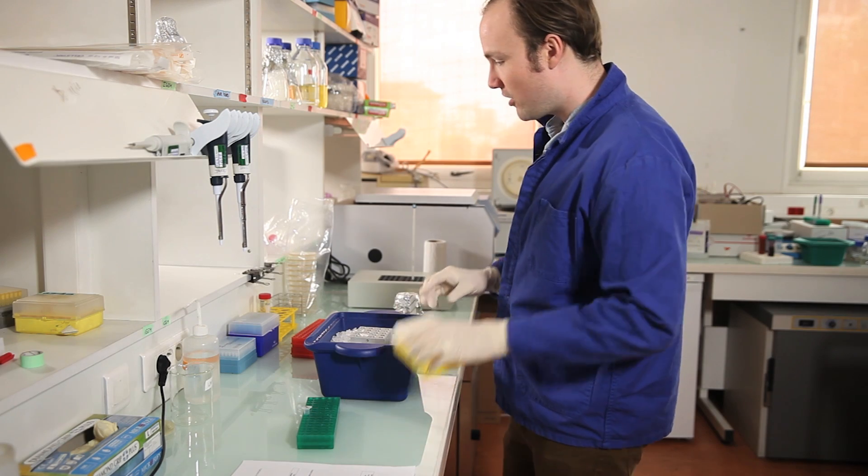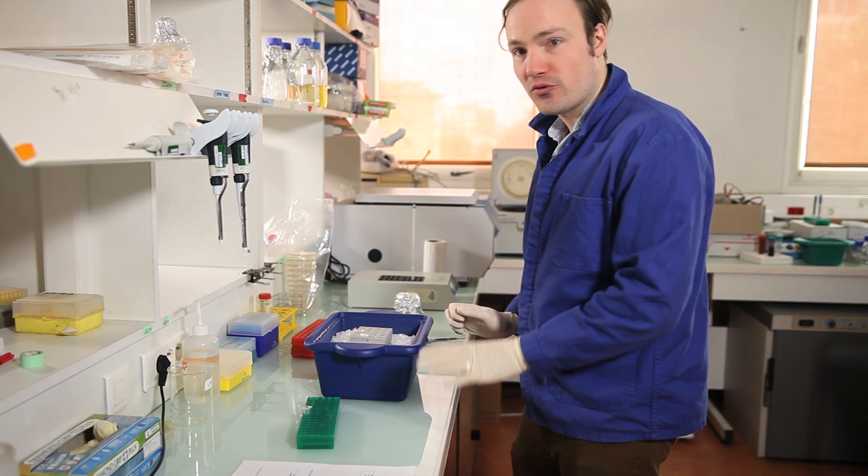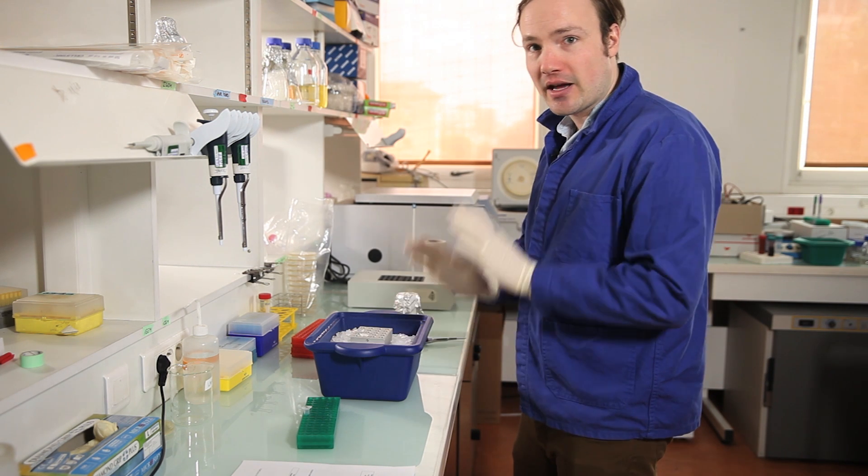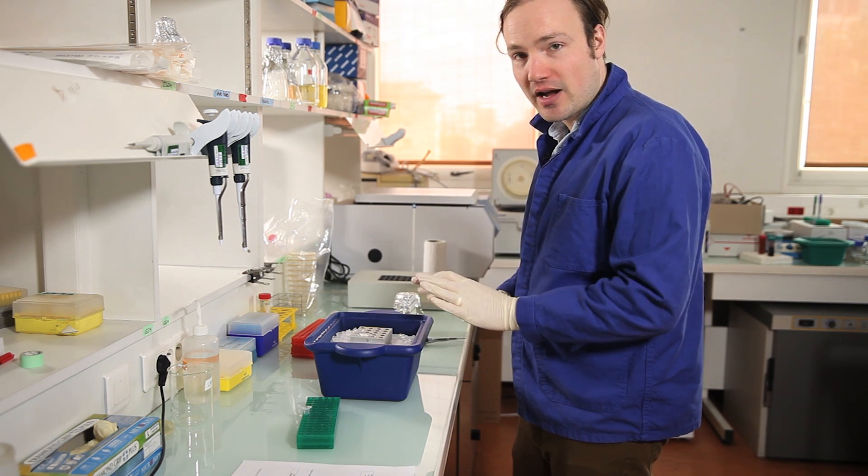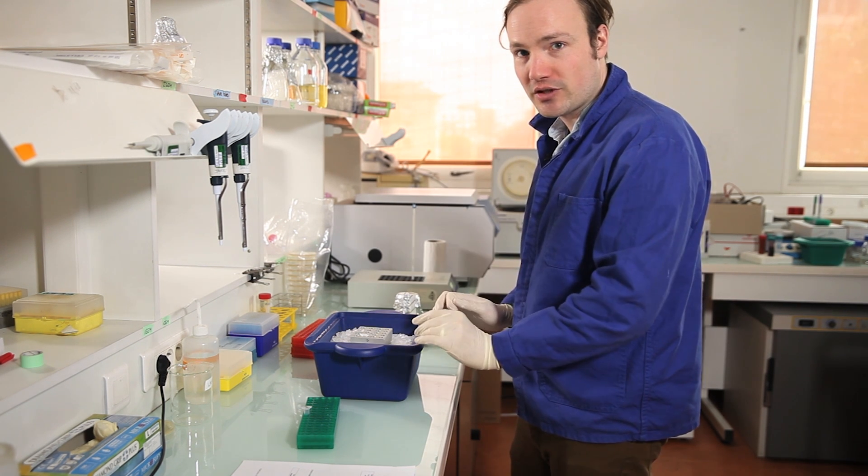To this, I'm going to add just a half a microliter of the plasmid that I want to transform. So in this case, we're transforming an intact plasmid at a very high concentration. So I only need to add a tiny, tiny amount to the cells for a successful transformation.